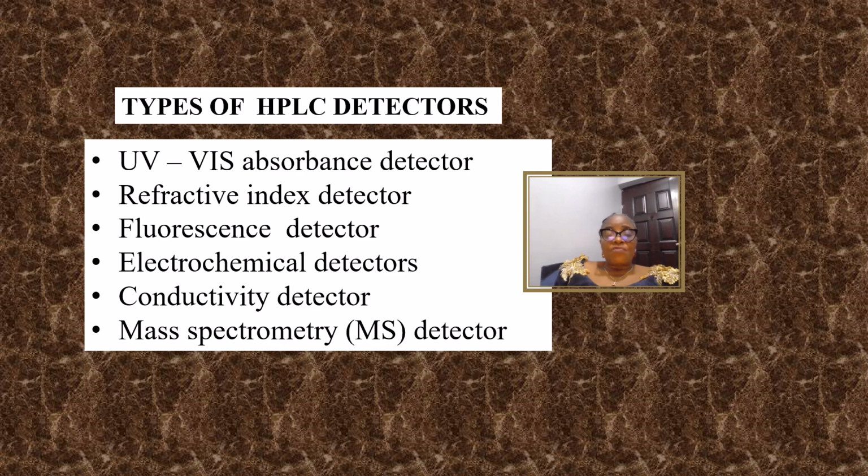Know that the selection of an appropriate detector for an HPLC analysis depends on the nature of the analyte, the sensitivity required, the application, and the type and compatibility. Each detector offers specific advantages and limitations.